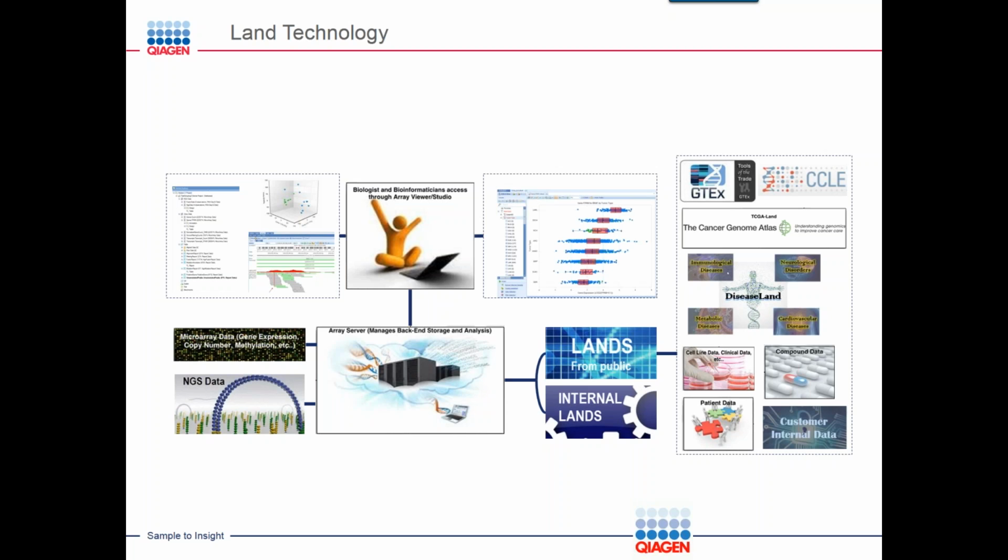They are processed in the same way, and we focus on the summarized data such as mutation, expression levels, but still allow users to access the raw data, for example, BAM files, or sometimes BAM summary files, what we call BAS files. And if there is a need, the user can always go back to the raw data and try to confirm the findings.